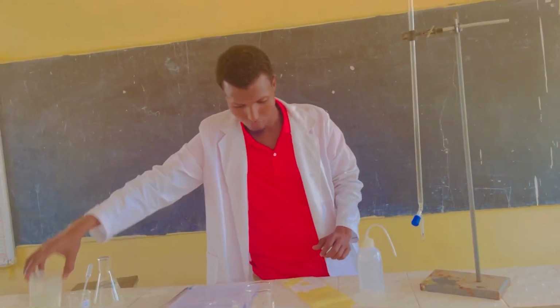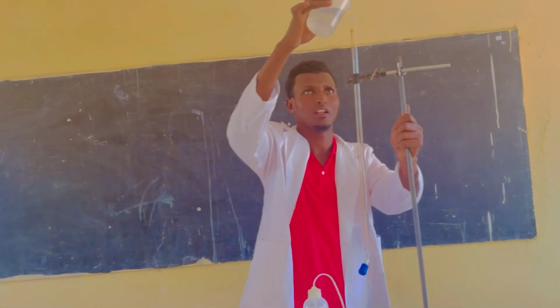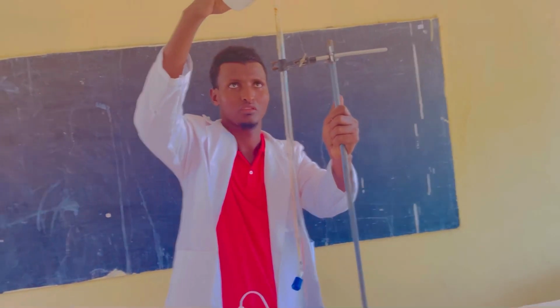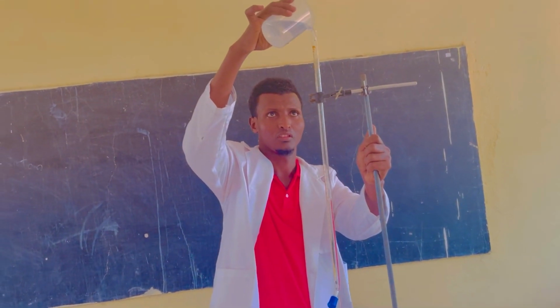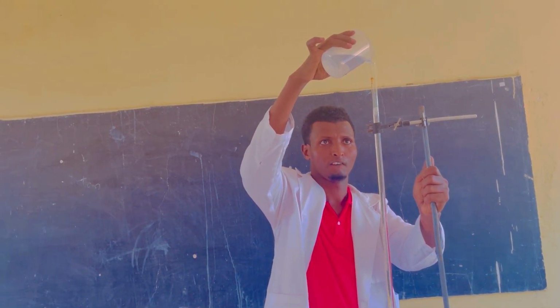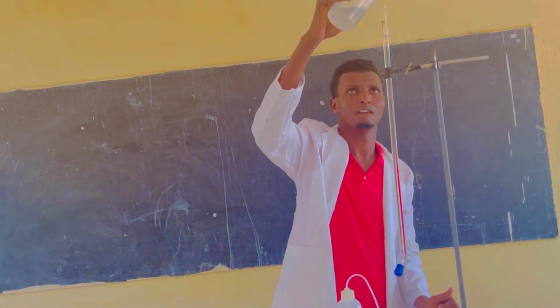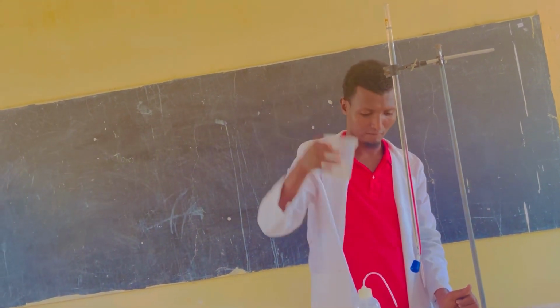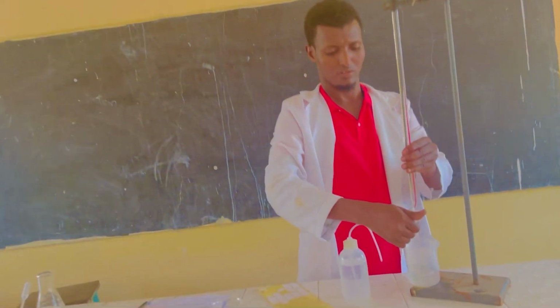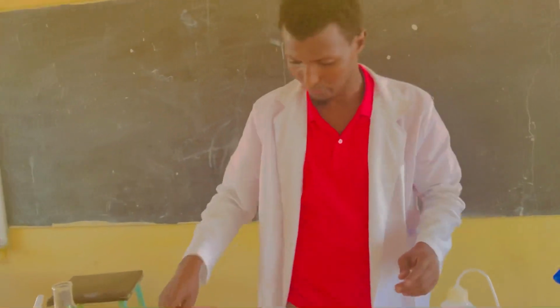Okay, this is my solution S now. Now I want to fill it up to the 0. So I want to fill it up to the 0. So now in the burette at 0, now I will do that. Now I fill my pipette.